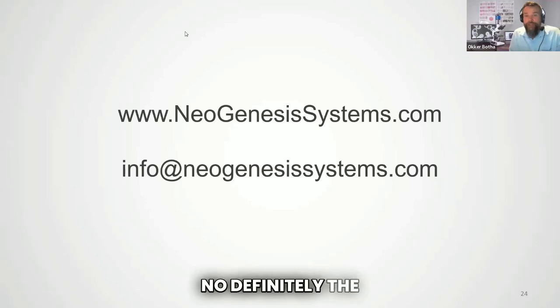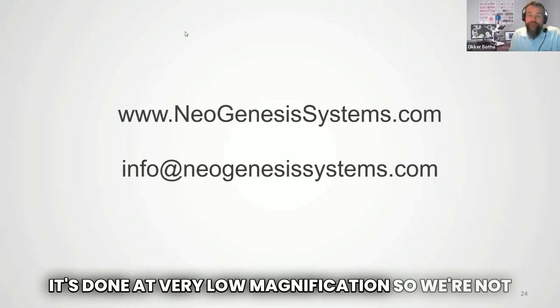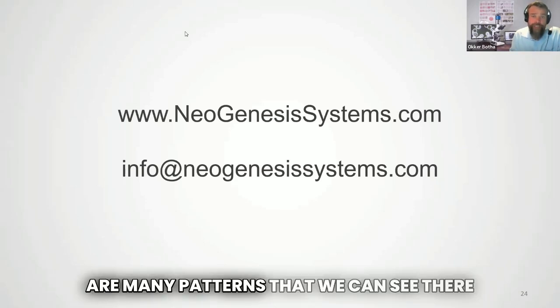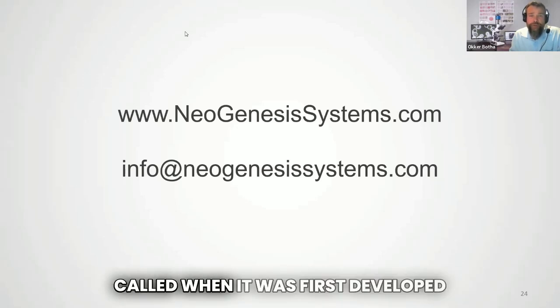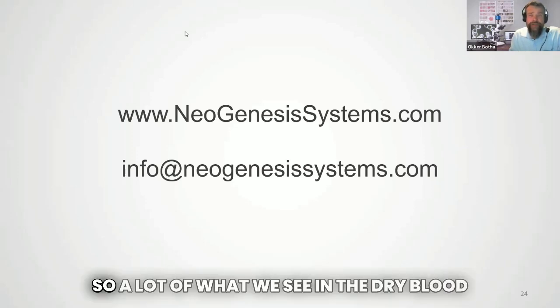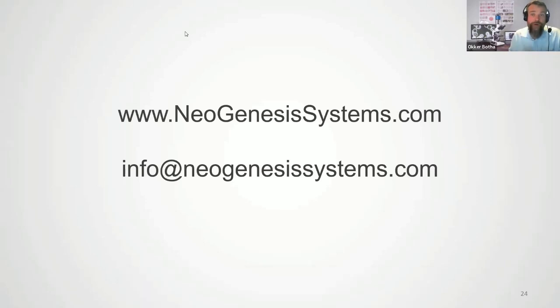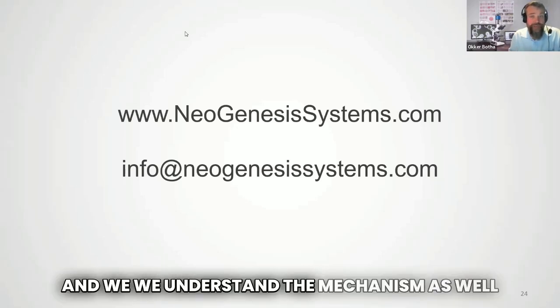Yeah, definitely it has its own set of strengths. It's done at very low magnification, so we're not looking at specific cells, but there are many patterns that we can see there. The dry blood analysis was originally called the oxidative stress test when it was first developed, so a lot of what we see in the dry blood sample relates to oxidative stress. Those white areas that we saw earlier are caused by the effects of oxidative stress on the tissues. And we understand the mechanism as well.